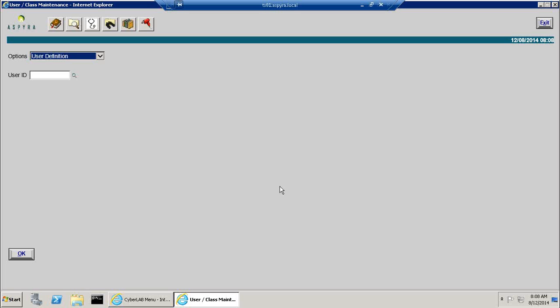Whatever is done here may be specific for certain users and certain classes, but you want to be sure that if you make any changes that would affect someone else, like I just did with Mr. Qua earlier, when we changed the admin user class to view only, he wasn't able to do what he needed to do.